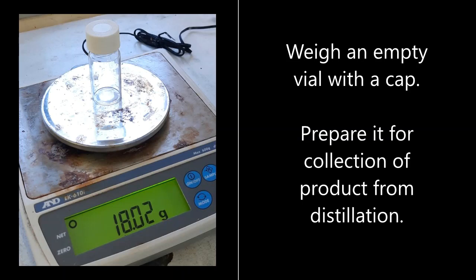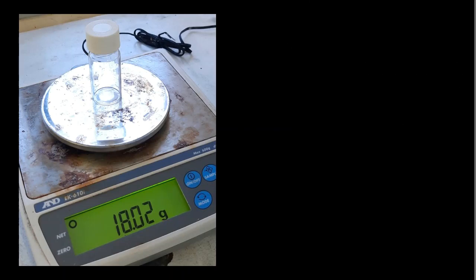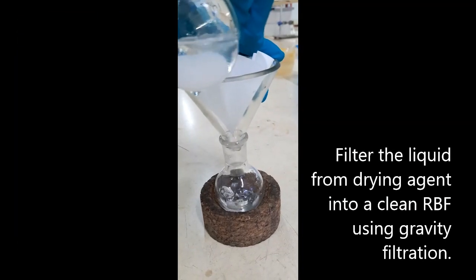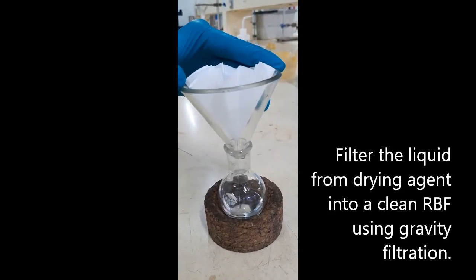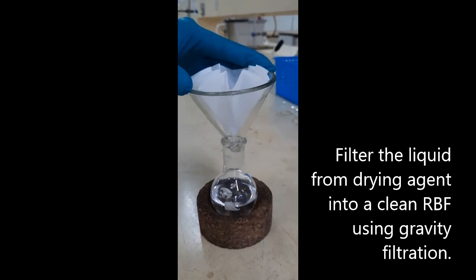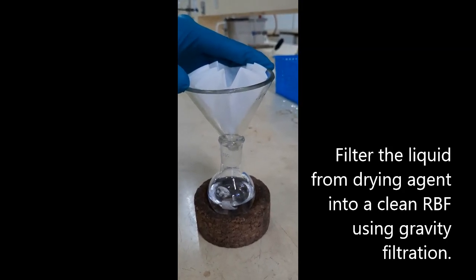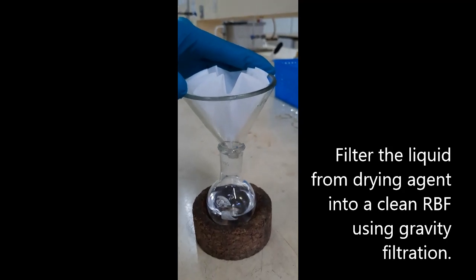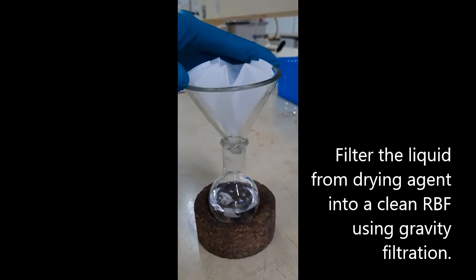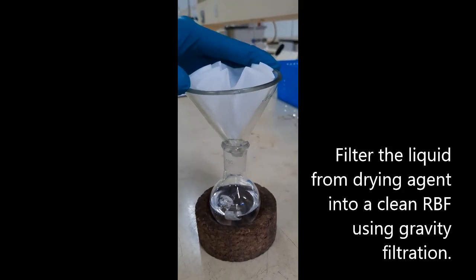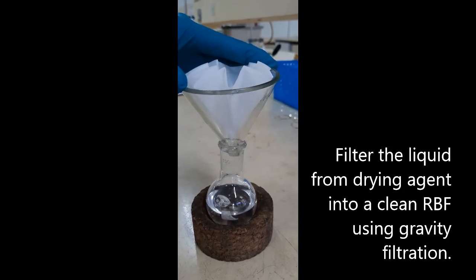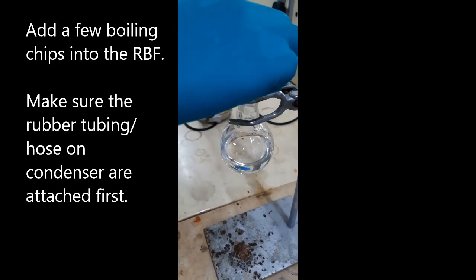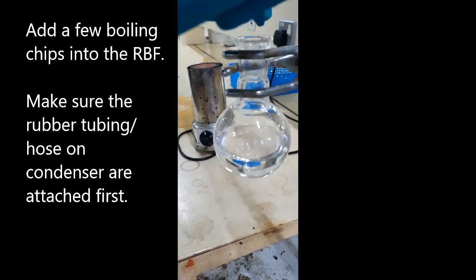Weigh an empty vial with the cap on and record the weight. Filter the organic liquid product through a filter paper straight into a suitable sized round bottom flask. Add a few pieces of boiling stones to the round bottom flask.